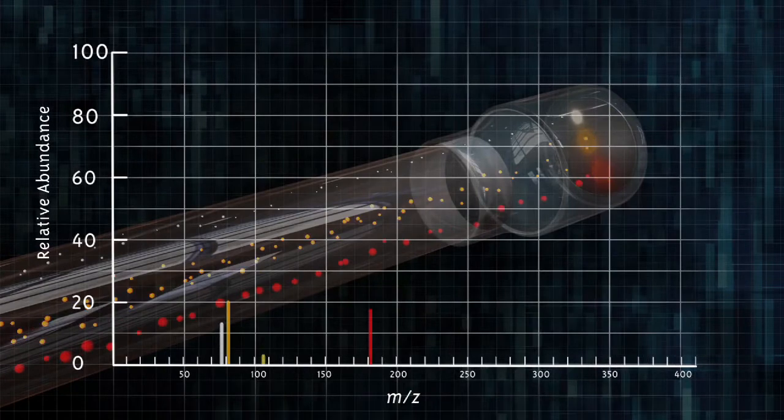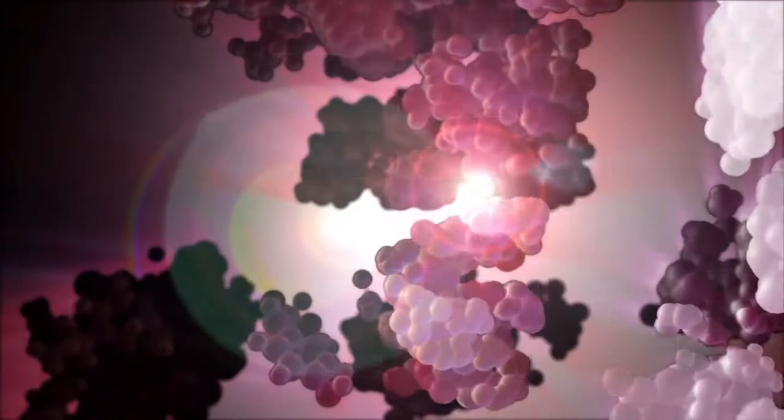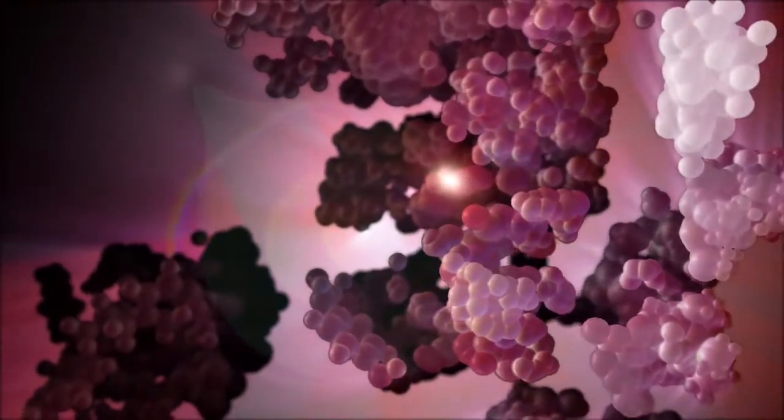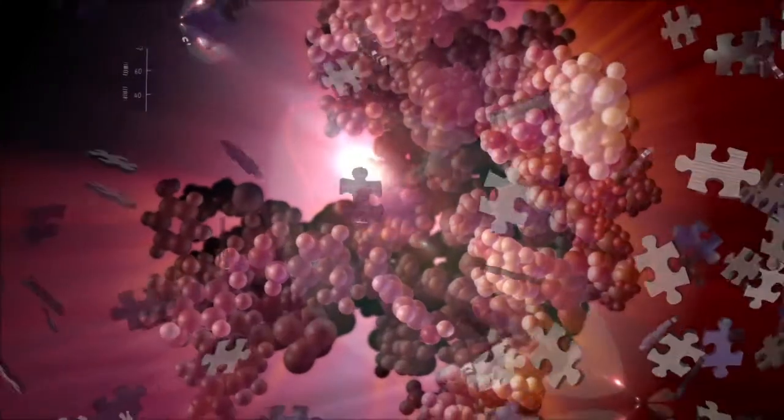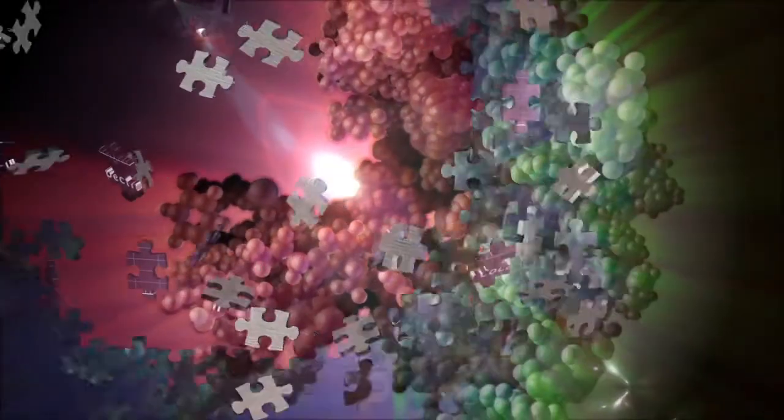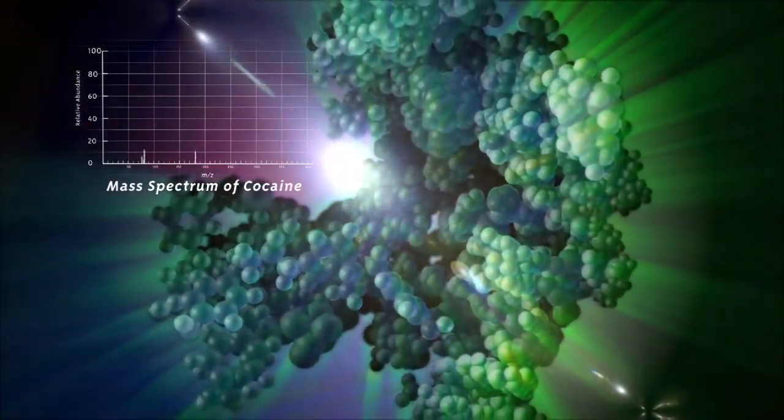To analyze the information and deduce the structure of the original molecule, a scientist must work backward, reassembling the fragments on paper. When all goes well, they fit together like puzzle pieces to reveal the composition of the original sample.